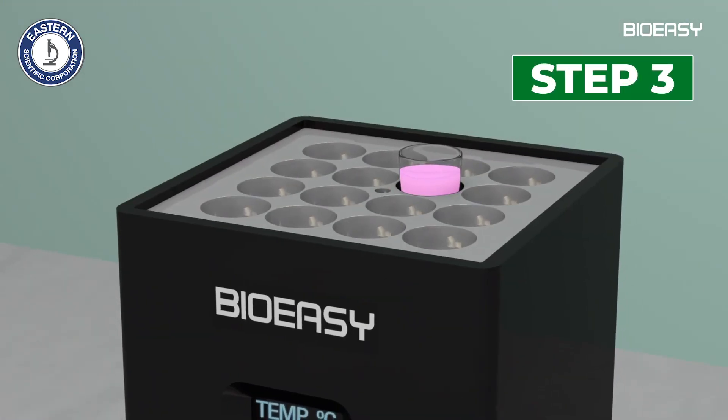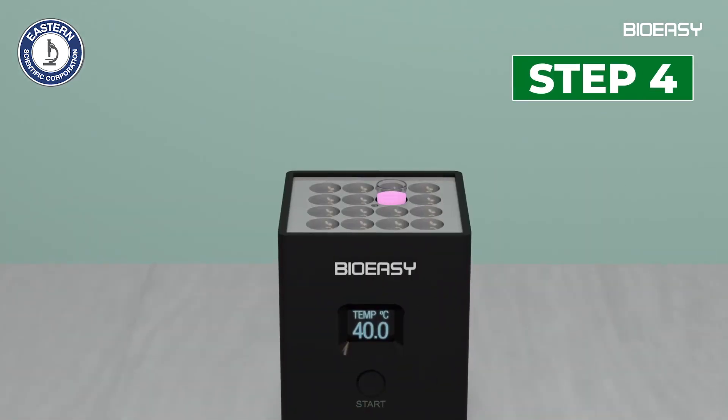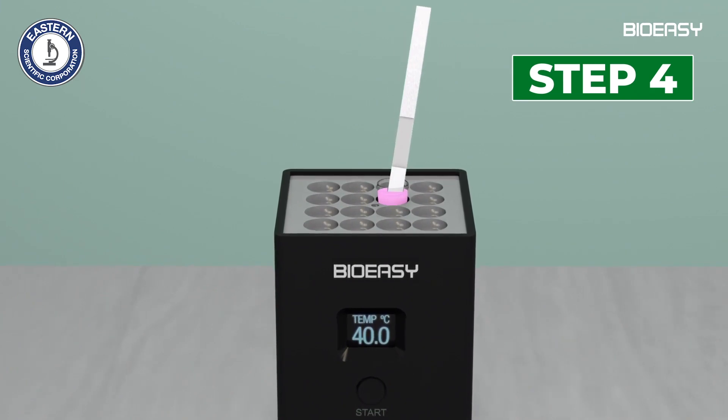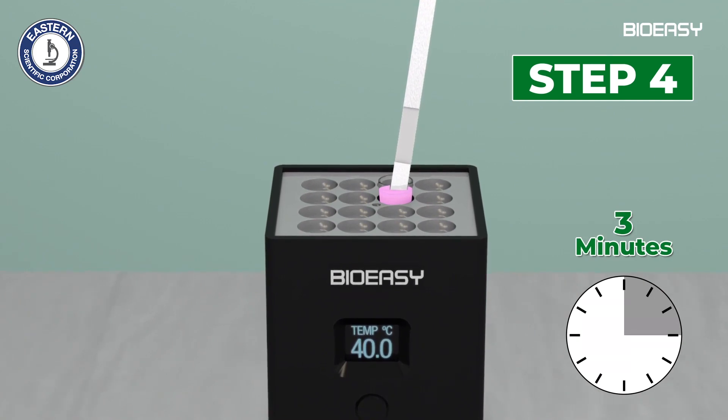Step 3: Incubate 3 minutes at 40 degrees Celsius. Step 4: Insert the dipstick into the microwell after the first incubation. Incubate another 3 minutes at 40 degrees Celsius.